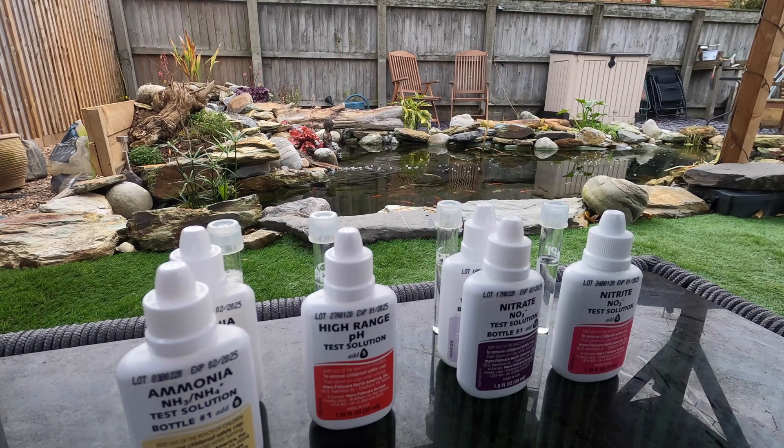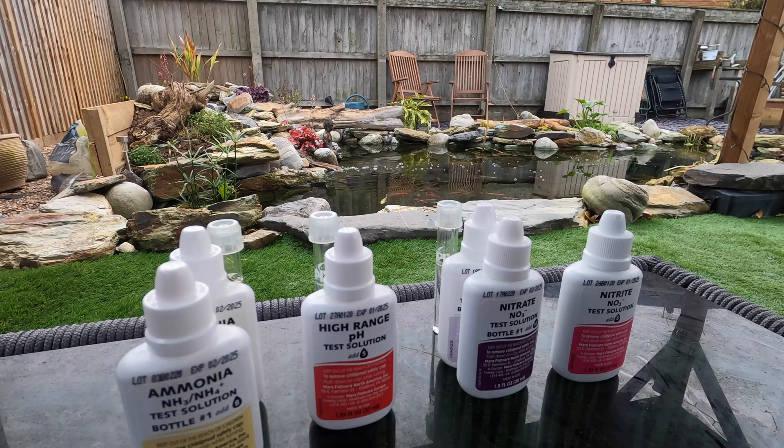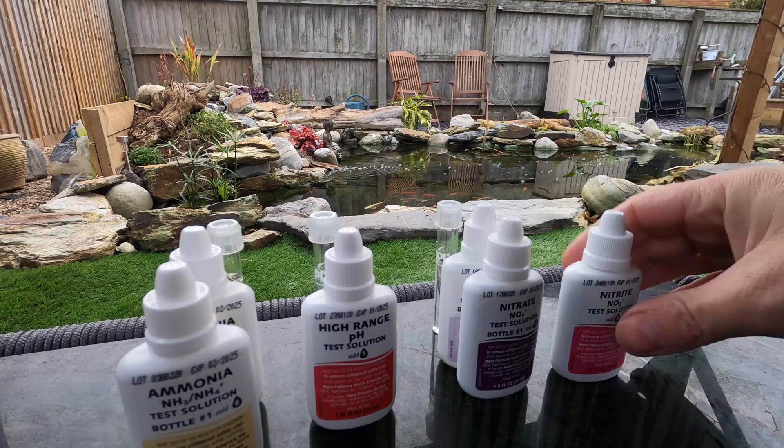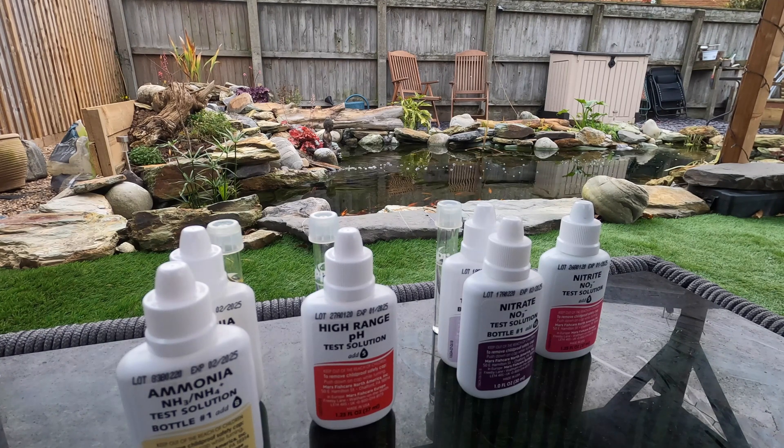I said we're going to do it in order - just for my own ease. So now we're going to do the nitrite test, and we're going to add five drops of this one. Shake for five seconds. With these two tests - the ammonia and the nitrite - you've got to leave those five minutes for the color to develop.